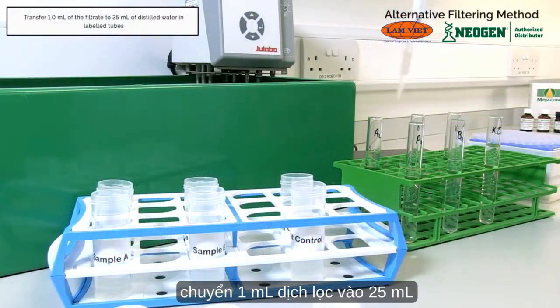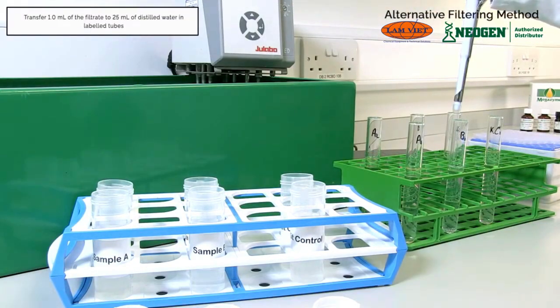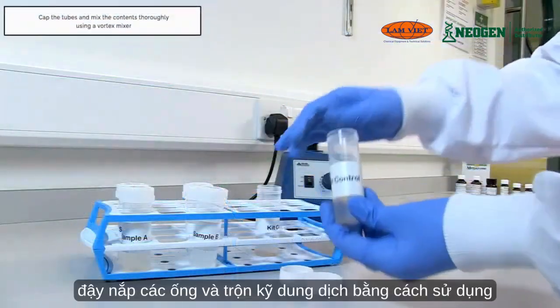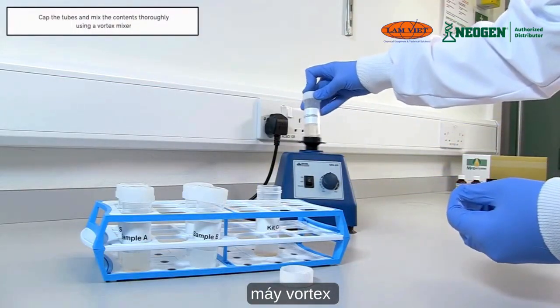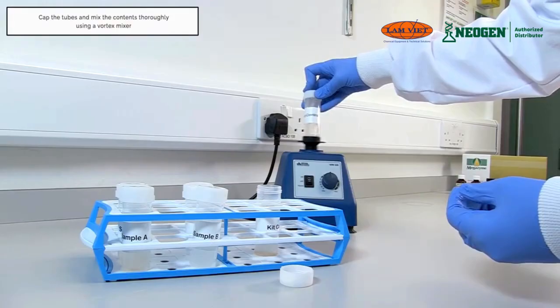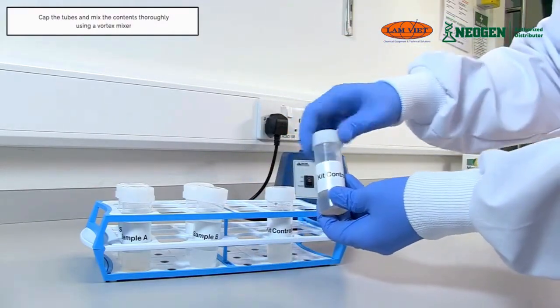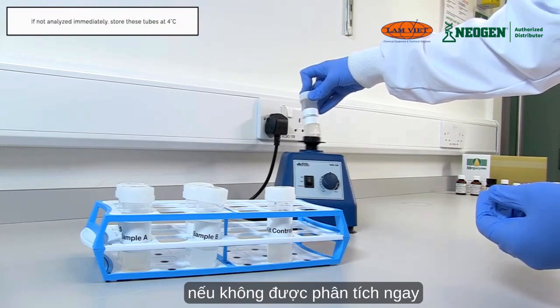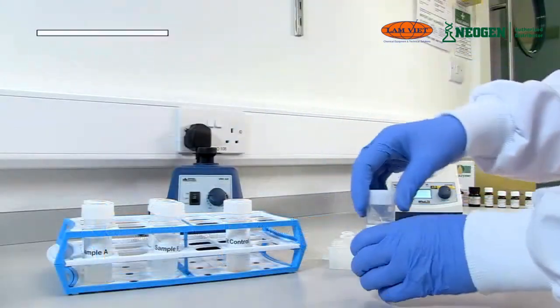Transfer 1 ml of the filtrate to 25 ml of distilled water in labelled tubes. Cap the tubes and mix the contents thoroughly using a vortex mixer. If not analysed immediately, store these tubes at 4 degrees Celsius.